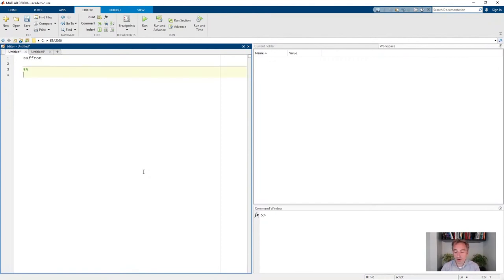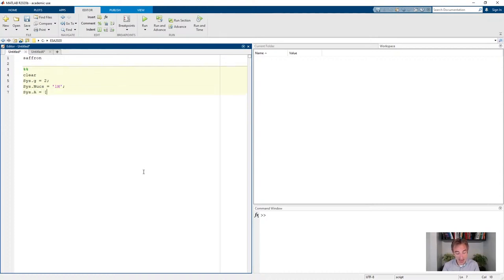Let's start by looking at a very simple example. We set up a spin system with a g value of two and add one proton on top of the electron with a hyperfine coupling tensor that's axial and small — three and six megahertz. The first number indicates the x and y value and the second number indicates the z value of the hyperfine coupling tensor.